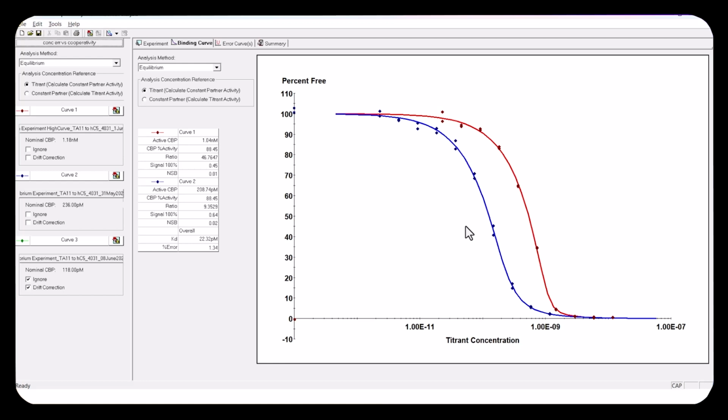Okay. So I'm suspecting this concentration error. I go back to the scientist who got this data and we review his notebook together, and I'm happy to say it was very clear and easy to follow, and it definitely laid out his calculations and they looked right, and it laid out his volumes of pipetting and all that added up and appeared to be correct. There was nothing in the notebook to support the hypothesis that this is an incorrect concentration. All right, in this case, I'm going to ask for a repeat. So that's what I did. I asked him to run this 118 picomolar curve again.